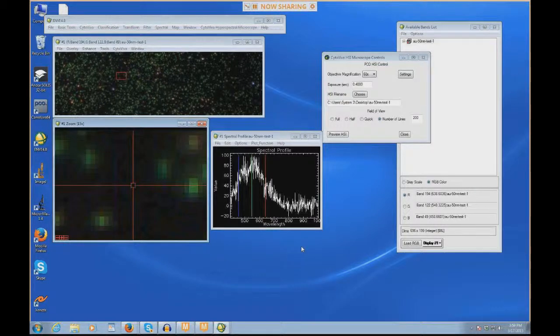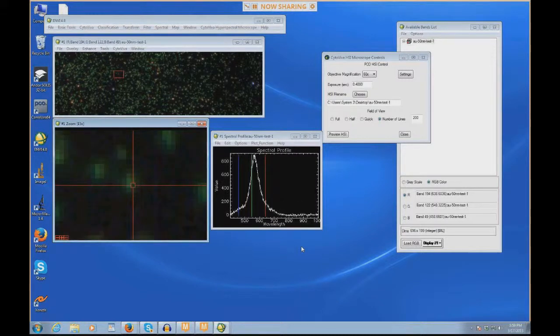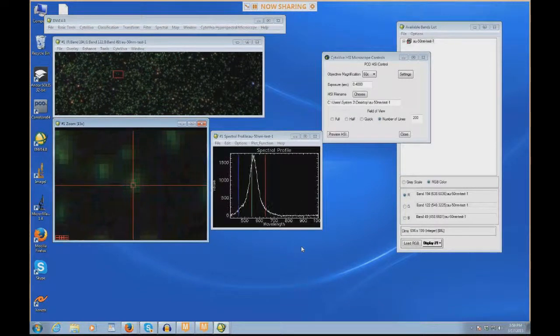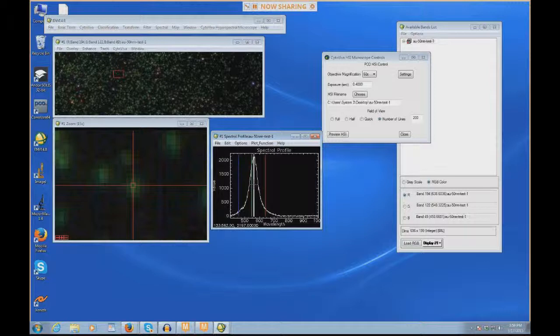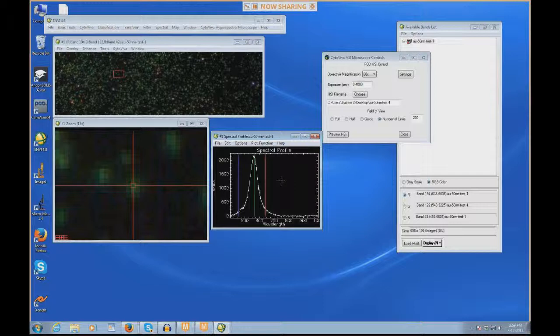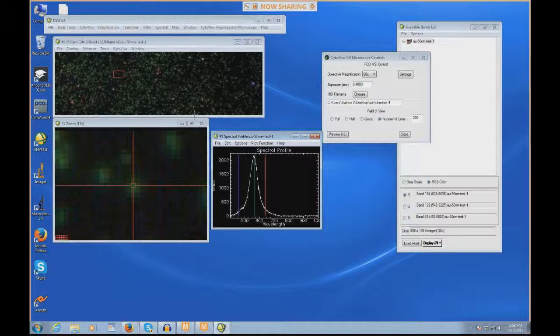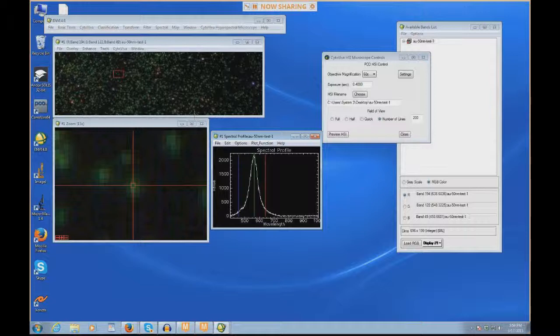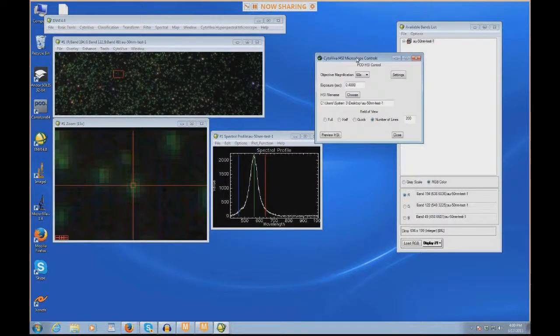If we just want to see some spectrum, we can right-click in any of the windows and pull up Z-Profile Spectrum. We can click anywhere and see the spectrum of this exact pixel. This dark area in between, we're not getting much information. But when we get to a particle, we see this particle has a peak at about 564 nanometers. In the preview window, I even mentioned earlier that a lot of these particles look like most of their information was concentrated in the 560 area. This scan was done nice because it's in focus. It's important to remember that when you're actually doing a scan, not to bump the table or the benchtop that you're working on and to keep your hands free of anything on the desk because any small vibration can cause these little wavy lines in the image.